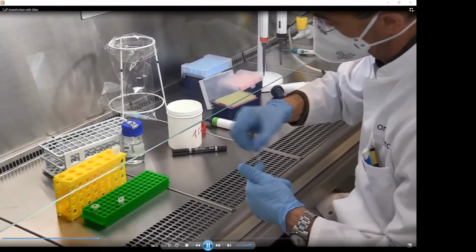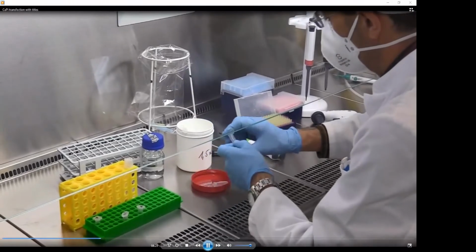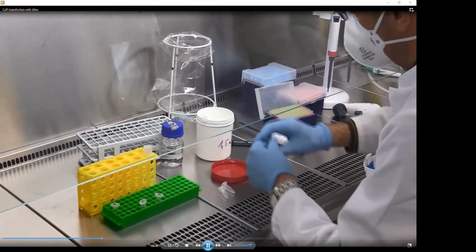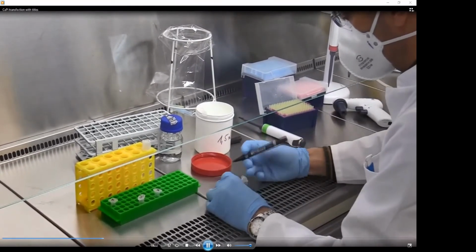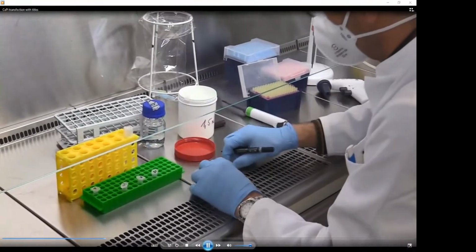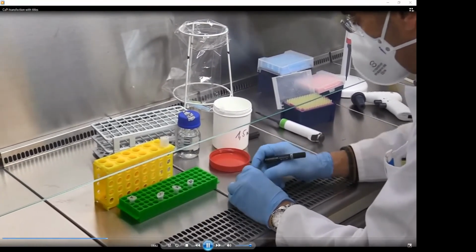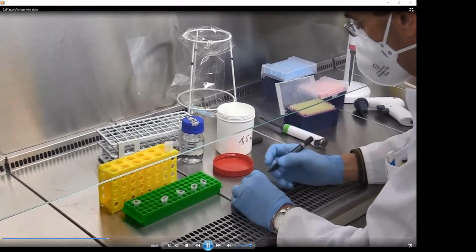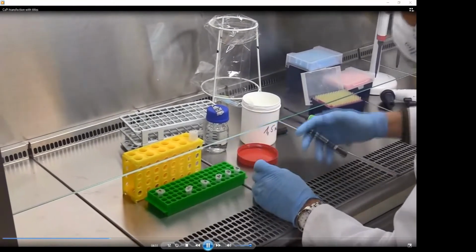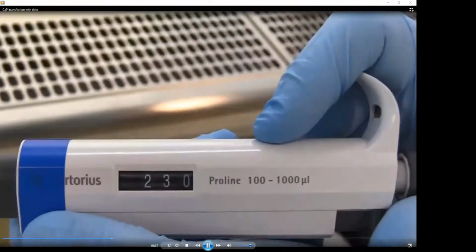This is another step which is necessary to notice, so it has to be properly mixed. And then from this one, we will make 3 different samples, which are B1, B2, and B3. B1 is the one where there will be only the empty vector DNA. B2 is the one where we overexpress T7. In this case, it's a Myc-His construct, which gives us the opportunity to detect the overexpression in Western blot using anti-Myc or anti-His tag antibodies. So if you want to prove it.